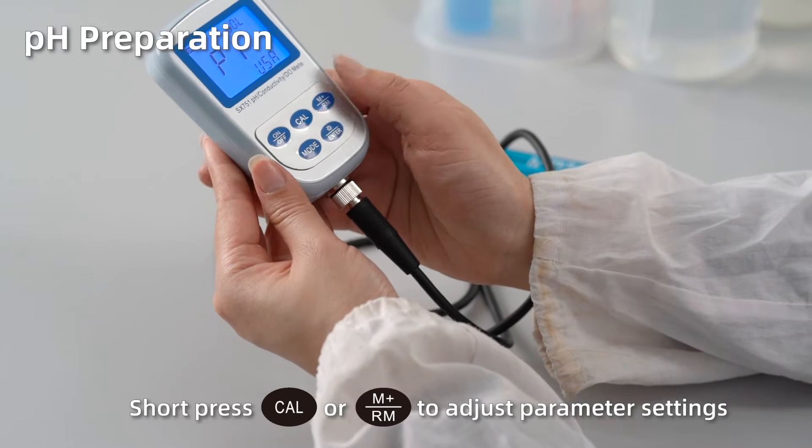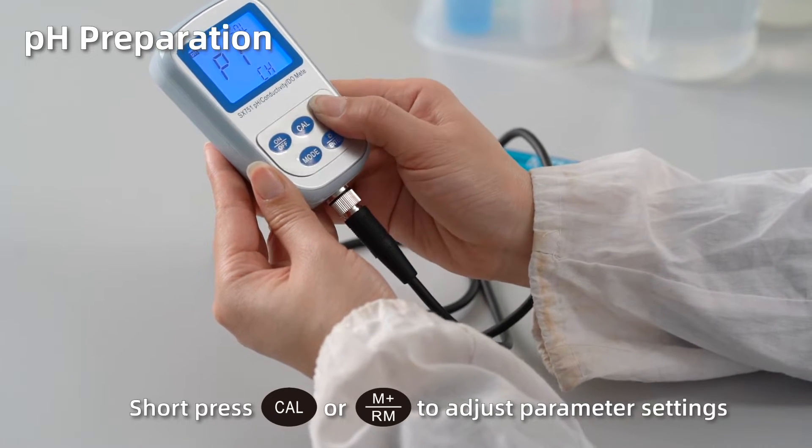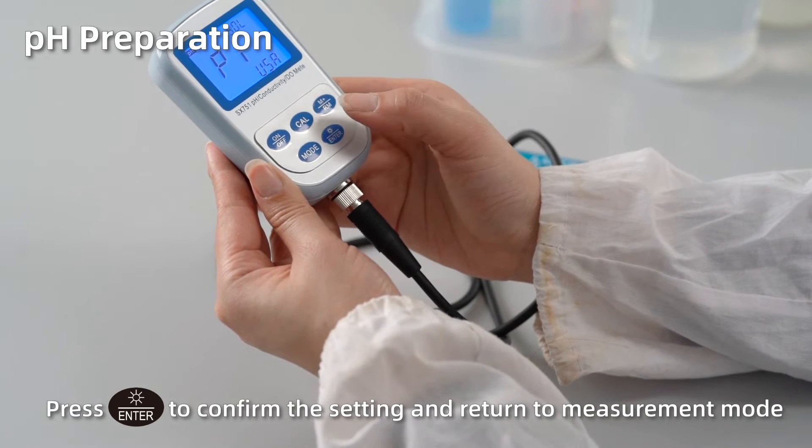Short press cal or M plus to adjust parameter settings. Press enter to confirm the setting and return to measurement mode.